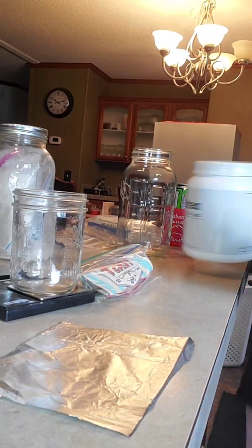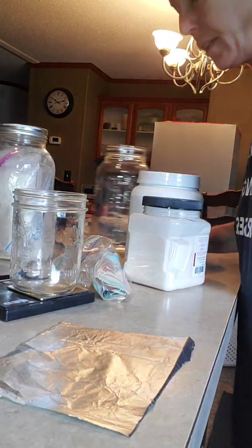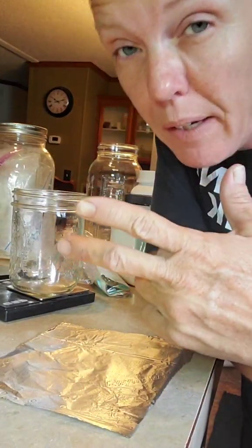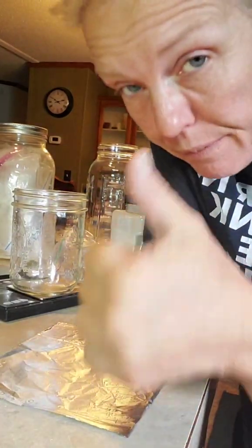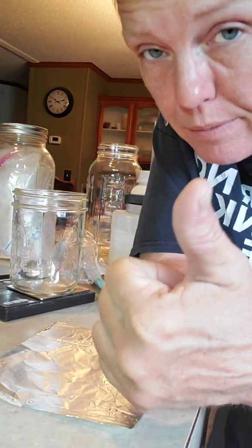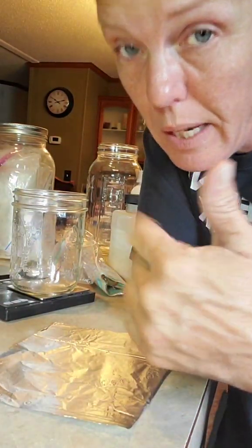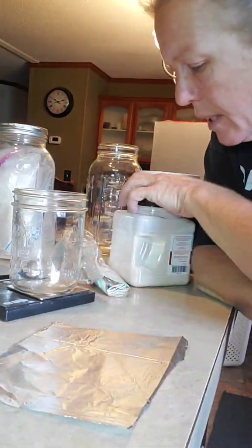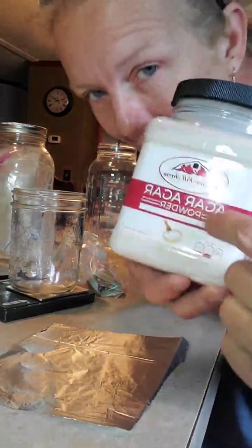Okay, agar. So, let's work on definitions here for a second. Agar. There are three main types of agar that we use in mycology. The first is potato dextrose. It is a pain in the ass to make. I use it all the time because I like it. You do it by boiling potatoes, adding agar.